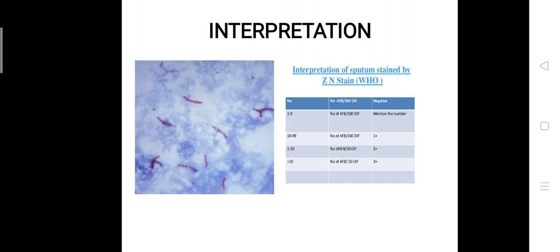They will look like red bright or slightly curved rods occurring singly or in small groups or may appear embedded, whereas the non-acid fast will look blue in color.